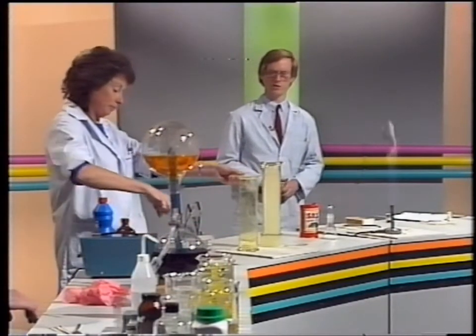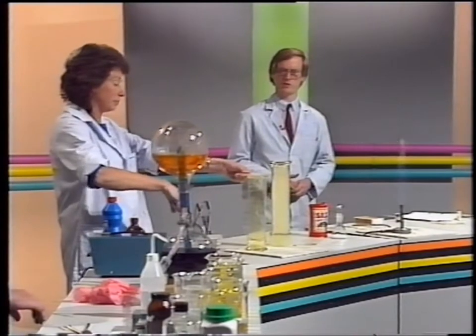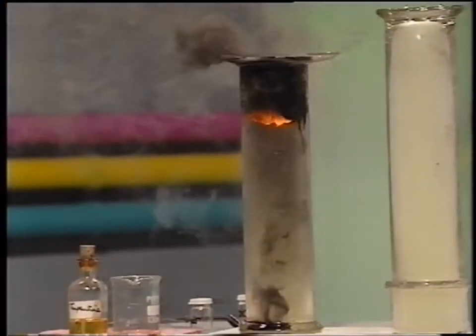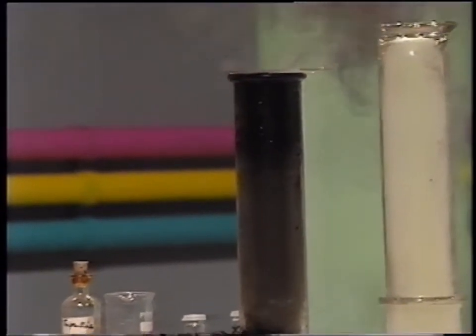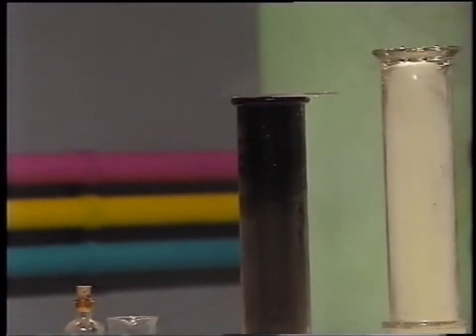Another reaction we can show you is a naturally occurring material, turpentine. When this reacts with chlorine, it burns, as you can see, and produces carbon, which is one of the elements that turpentine contains.